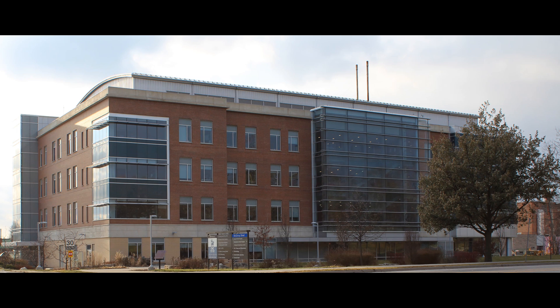Hi and welcome to the Animal Health Laboratory at the University of Guelph. We're sharing this video so you can see what it's like inside a commercial laboratory and so that we can share some top tips for you to get the most out of your lab submissions.